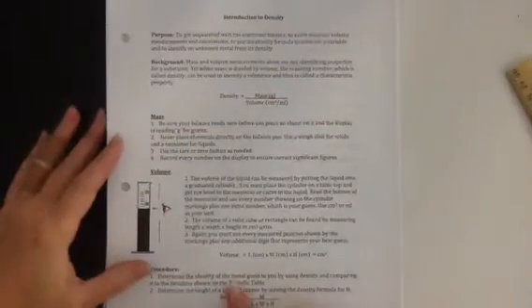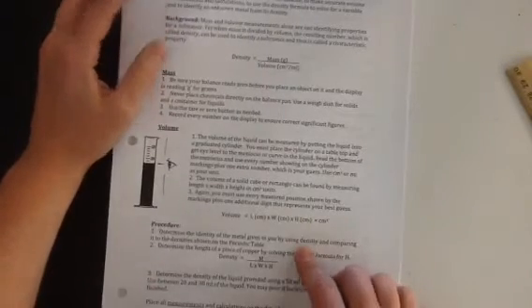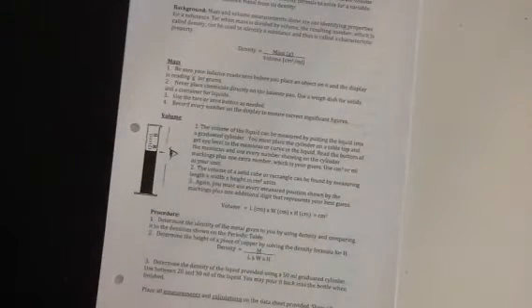How many parts? 3. The first part, you're going to determine the identity of an unknown metal given to you by calculating its density and comparing it to the densities on our periodic table. So periodic table in the front, periodic table in the back. The bottom right-hand corner gives you the density of the metal. It's right here, density of the metal. So barium has a density of 3.51.